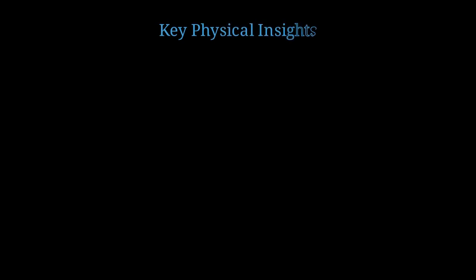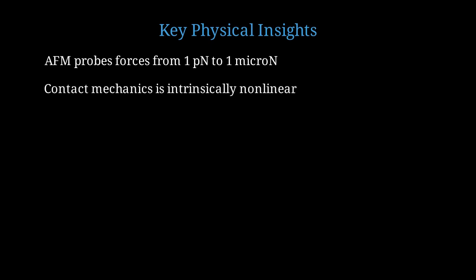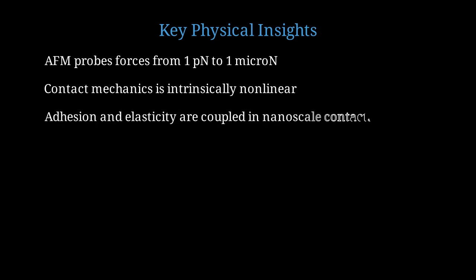Beyond the technical workflow, let's highlight the key physical insights from today's lecture. AFM can probe forces over 6 orders of magnitude, from 1 piconewton for weak molecular interactions up to 1 micronewton for contact mechanics. Contact mechanics is fundamentally nonlinear. The 3/2 power law means force increases faster than linearly with indentation due to the increasing contact area. At the nanoscale, adhesion and elasticity are intimately coupled. You cannot simply add them. The contact area itself depends on the adhesive forces through the JKR or DMT models.